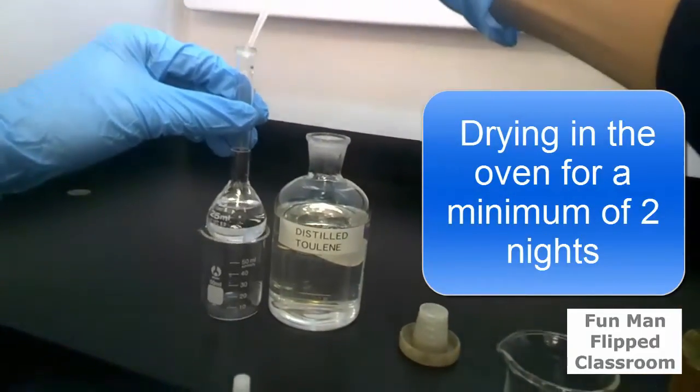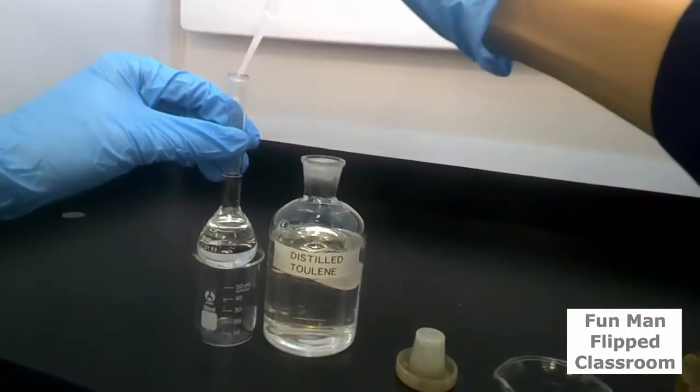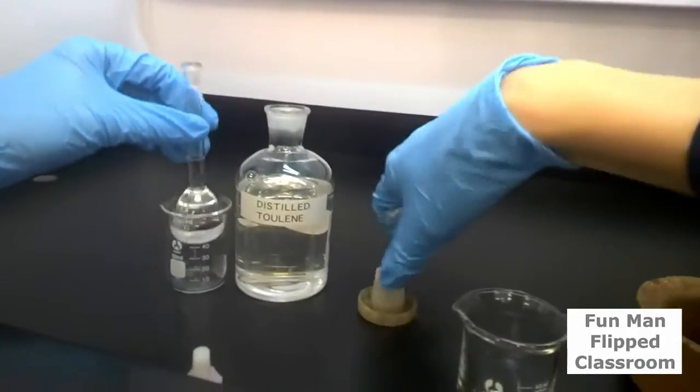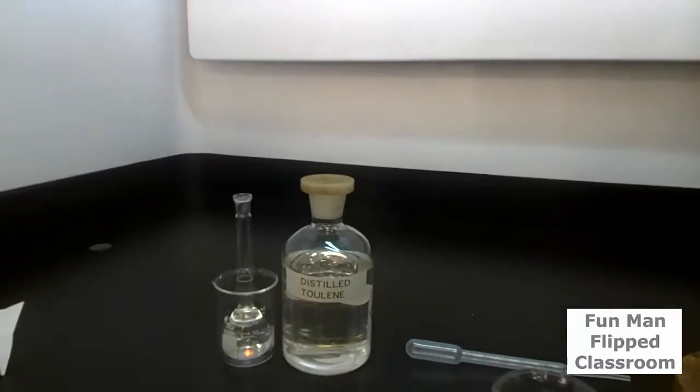Be very careful every time we're doing this in the fume hood, since toluene is flammable and it's toxic to our health. So I will start with this level, cap this on, and do not forget.